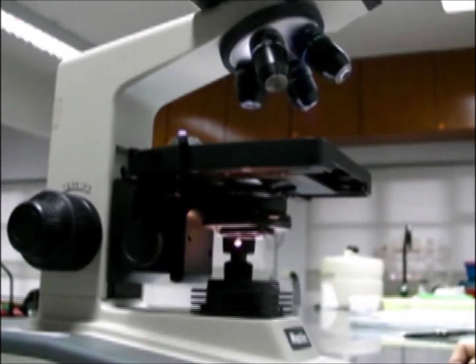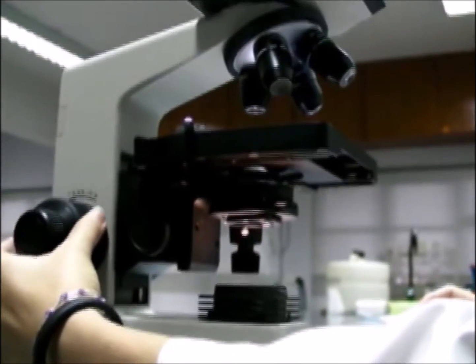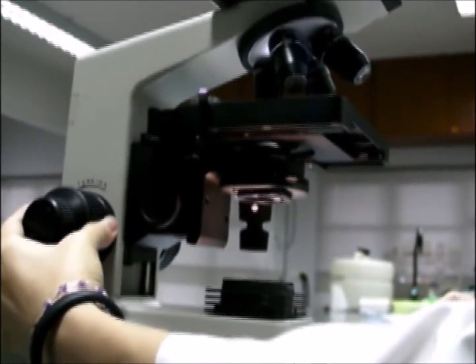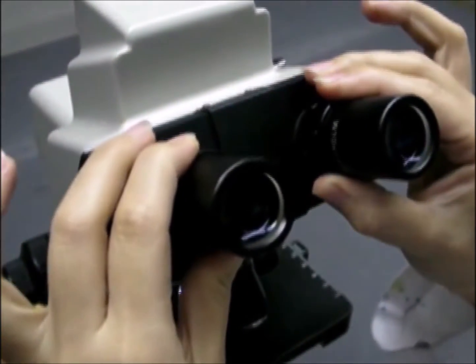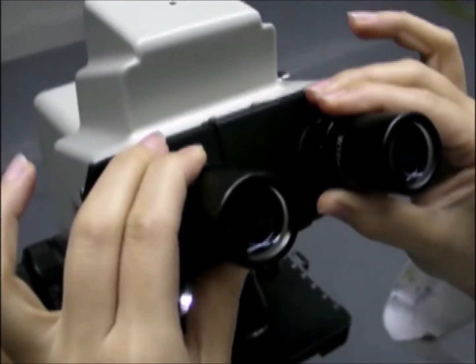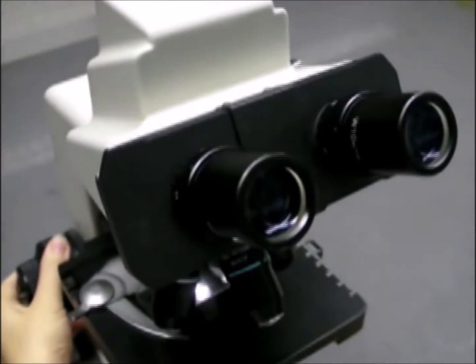Now, bring the microscope stage up until it can no longer move upwards. It is a good practice to focus the slide by moving the stage downwards so that the slide moves away from the objective lens. Adjust the eyepiece to accommodate the width of your eyes. If you are short-sighted, you can view the image without using your spectacles, but you will need to adjust the eyepiece by turning it until you can see the image through the eyepiece clearly.